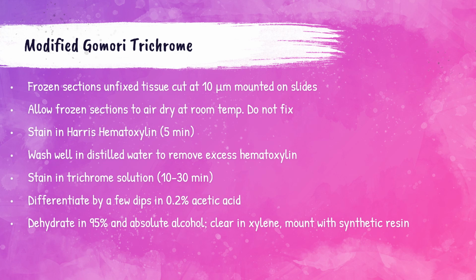Then it needs a 10 to 30 minute stain in trichrome solution. And after that 10 to 30 minute period, it needs to be differentiated by a few dips of 0.2% acetic acid. Then dehydrate in 95% and absolute alcohol, clear in xylene, and then mount with a synthetic resin.